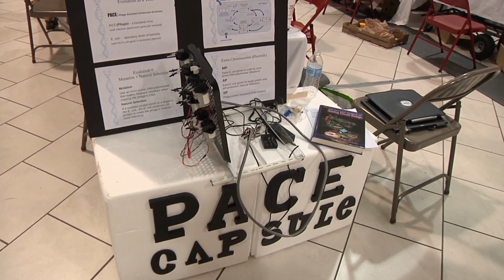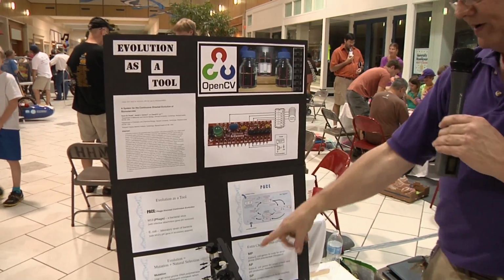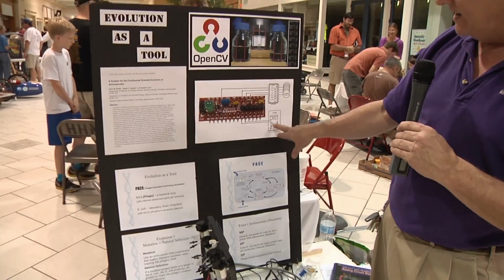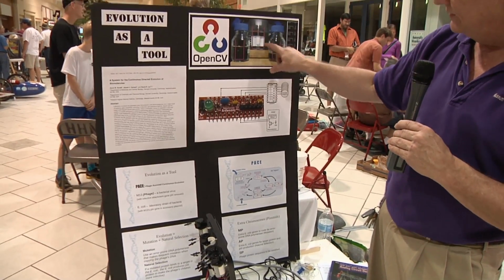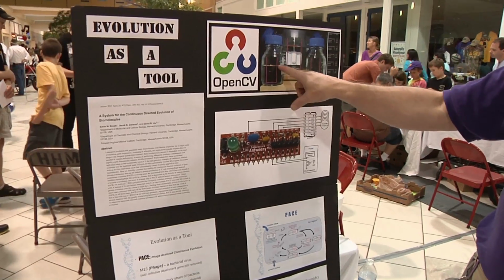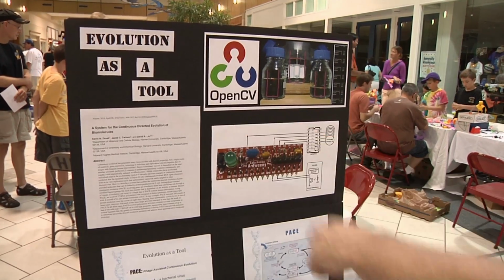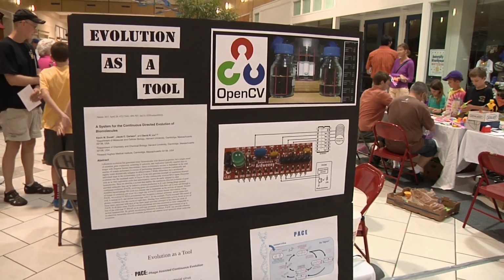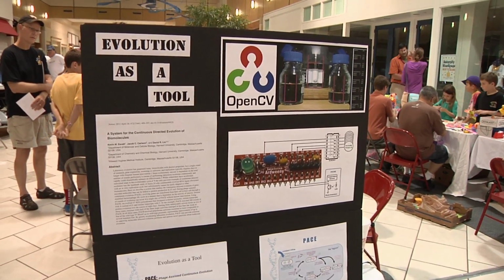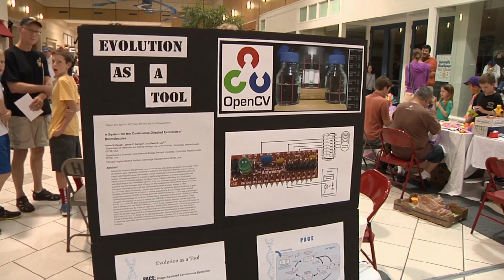And so the 2 real breakthroughs that made it all cheap is using the Arduino to drive the peristaltic pumps and to measure the turbidity of the E. coli culture with a photosensor, and then using OpenCV to grab the chemical levels. So I can't take credit for the basic idea. Esvelt, Carlson, and Liu at Harvard are the guys who came up with the whole PACE concept. But I can do it for on the order of $400 or $500 instead of $25,000.